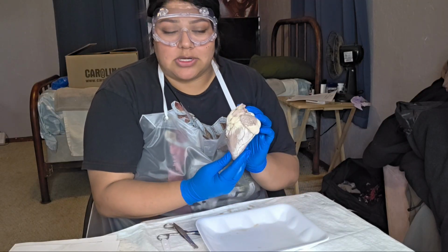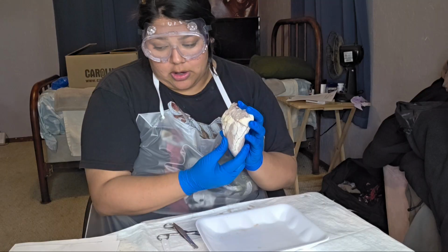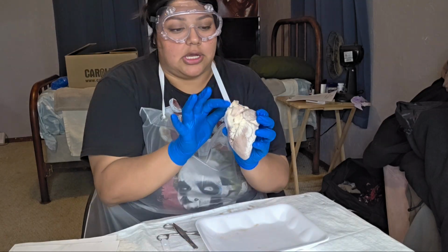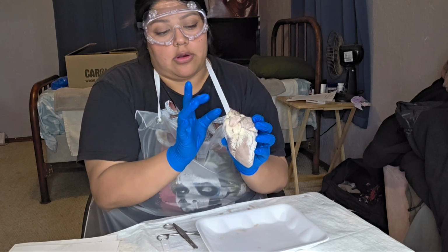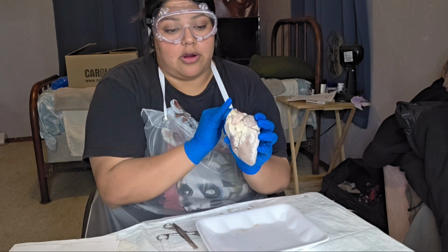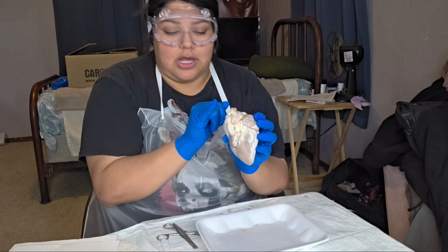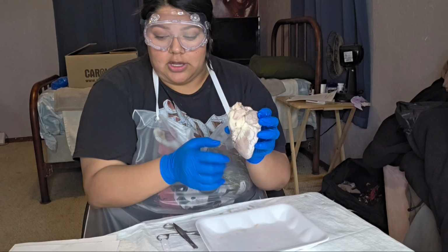I believe ours has been completely removed already. We can see straight to the myocardium, or the thick muscle all around. At the top, or the base, we have our major vessels: our pulmonary artery, our aorta, and our superior vena cava, which will then go down into the inferior vena cava.